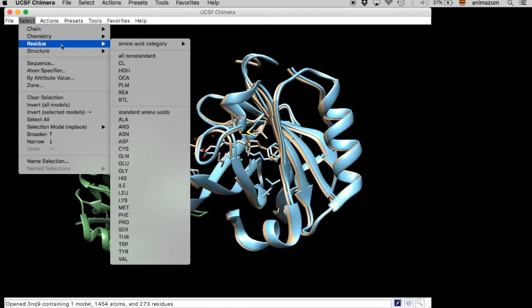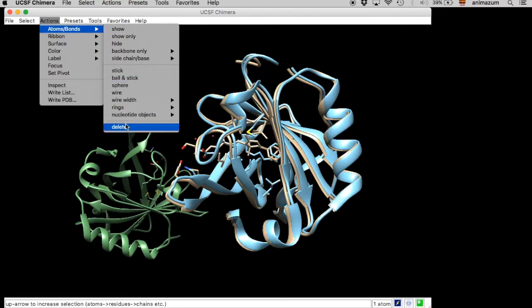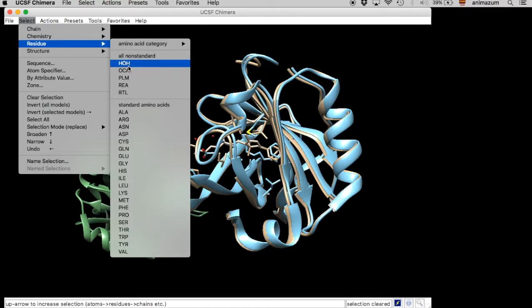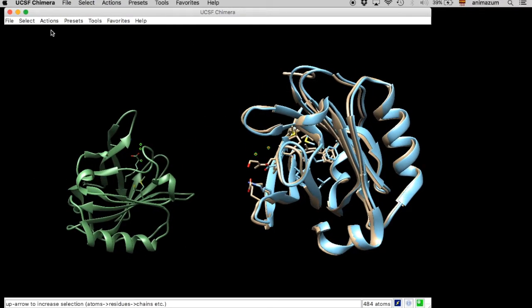First, we are going to clean all structures from any compound that is not part of the protein or ligand. We select them and then we eliminate them — we delete.